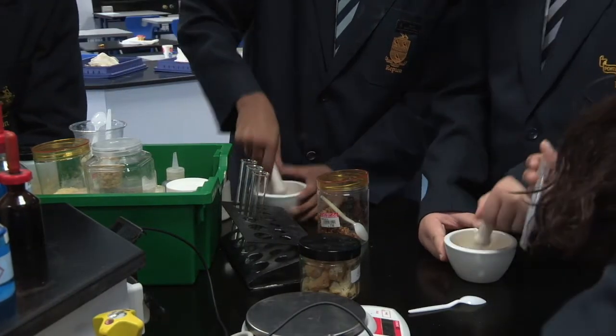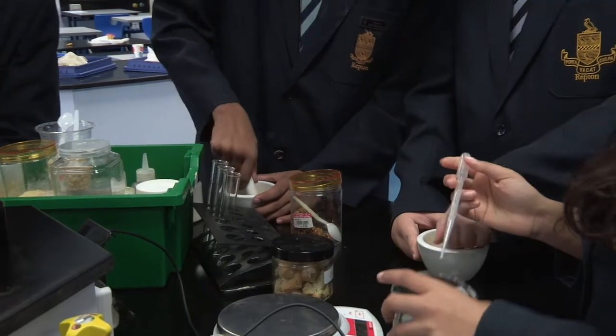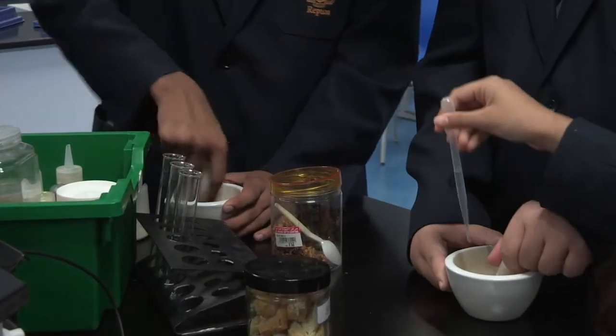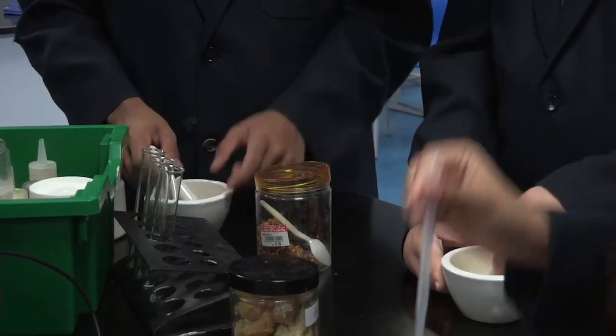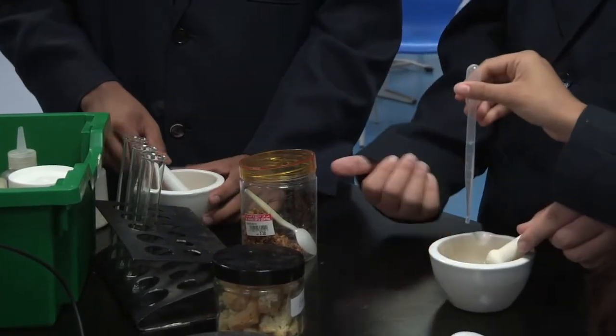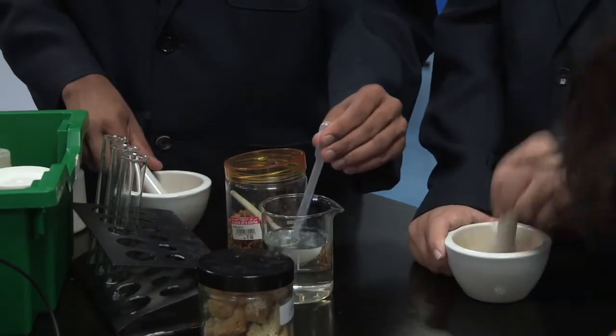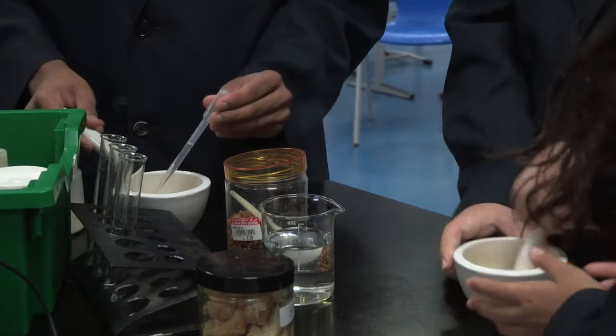I'm going to add a little bit of water to help break it down.